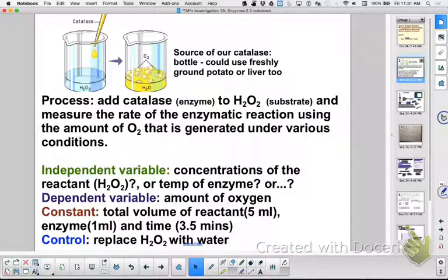So in this lab, you are going to take hydrogen peroxide. Can I get eyes up here, not on your lab maps, but up here? Hydrogen peroxide, and you're going to add the enzyme catalase. It's not yellow. Every fluid today is clear. This is why you have to be very, very OCD today. I want you to be focused, because if you mess up the syringes or the solution, your lab will be messed up for sure. Because they're all clear solutions. You can take your hydrogen peroxide, add your catalase, and that's going to generate water and O2.